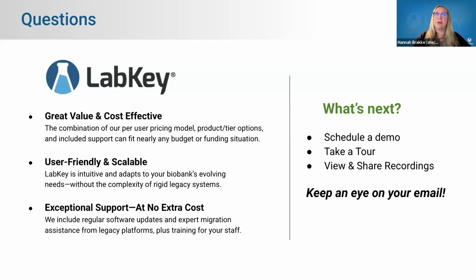We also pride ourselves on making it very user-friendly, so you're able to make adjustments over time as you need to, as well as scalable. We know that many biorepositories and biobanks out there have millions of specimens in their collection, and we're able to handle and support you as you scale as well.